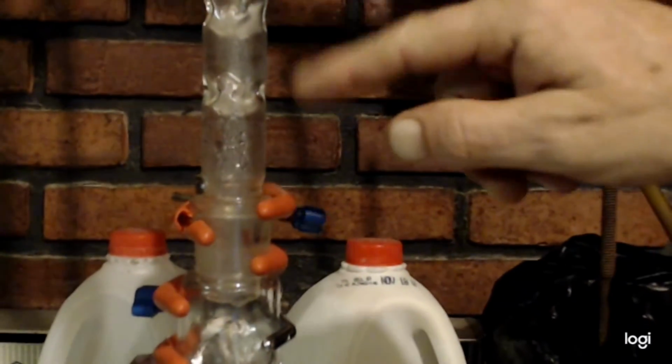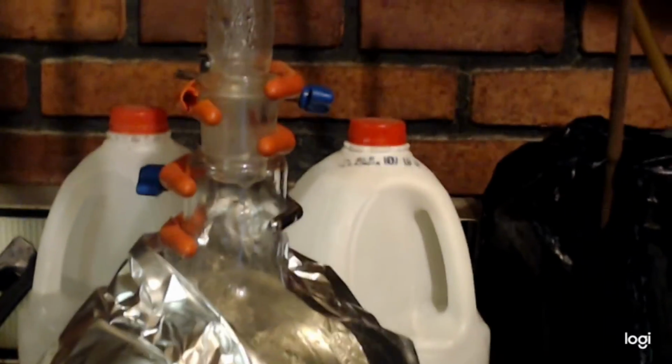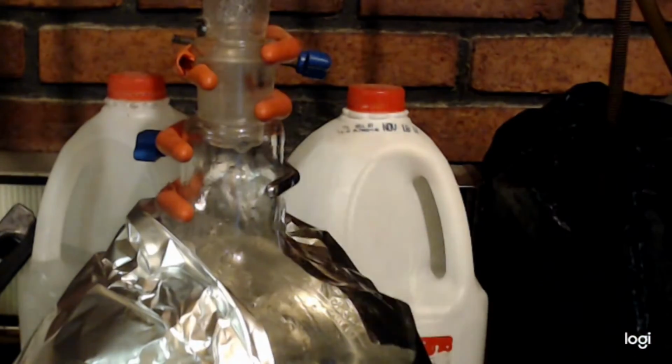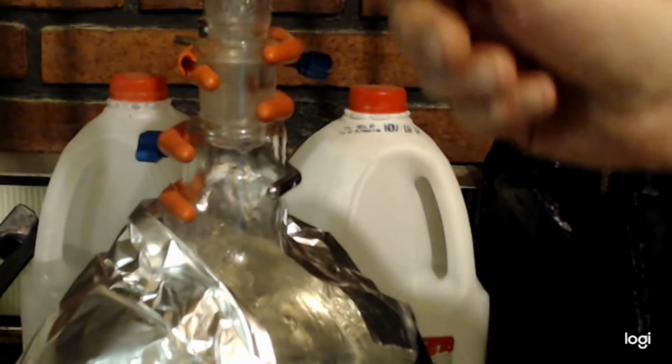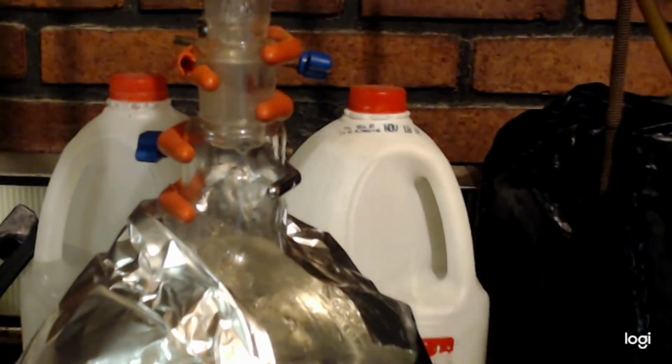Starting to get a little bit of water in here. Even though it's not boiling, I think because it's got the ammonia gas coming out and it's pulling water with it a little bit. That's why it's condensing up here, I think, because it's not really dripping a lot.